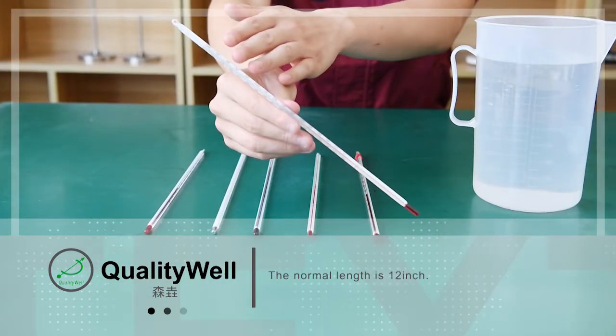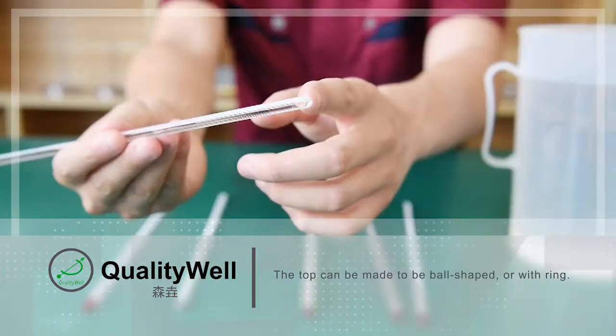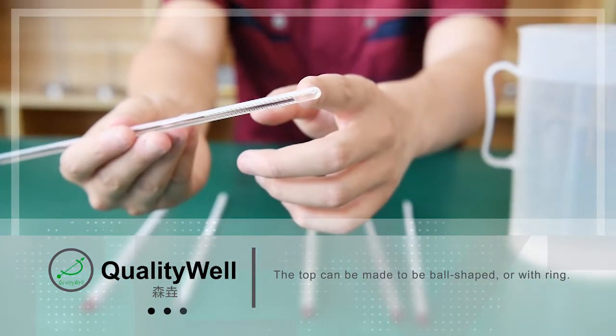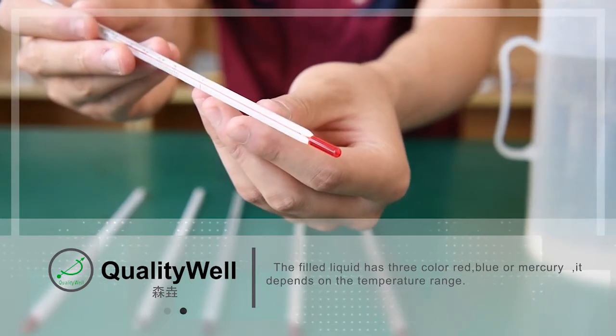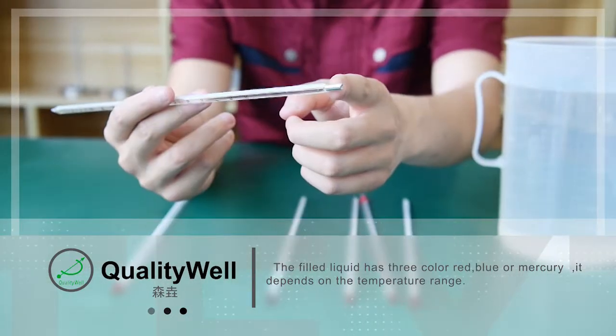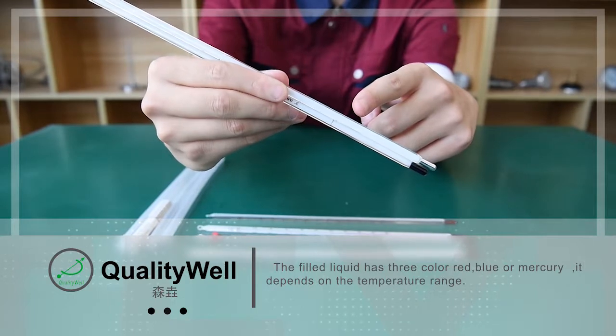The normal length is 12 inches. The top can be made to be ball-shaped or with a ring. The filled liquid has three colors: red, blue, or mercury. It depends on the temperature range.